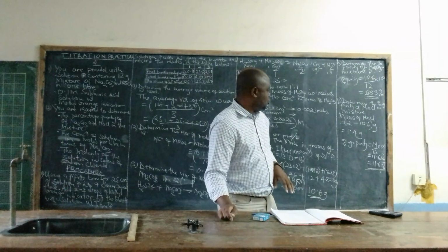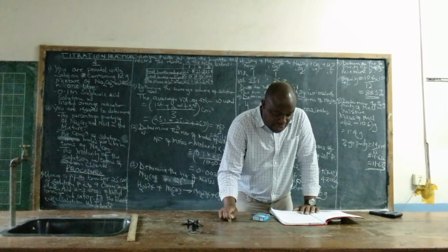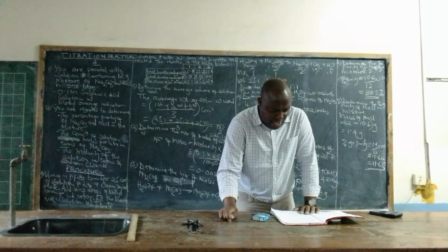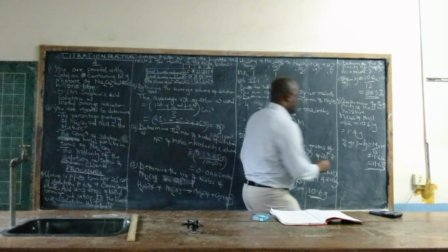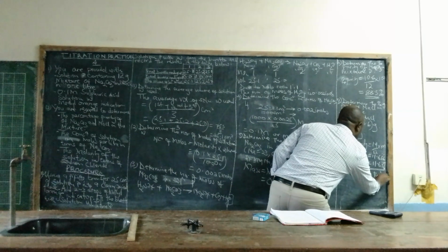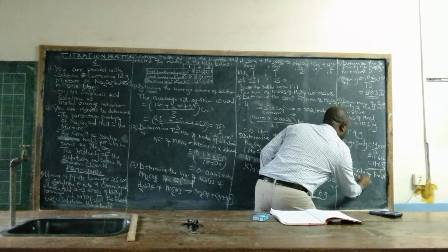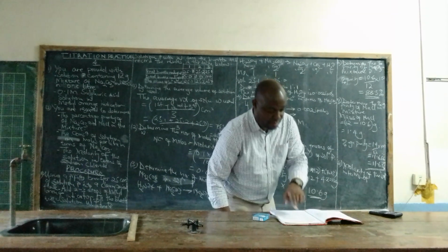Question number 8. We are supposed to determine the molarity of the solution in terms of sodium chloride. Number 8. Molarity of the solution in terms of sodium chloride.